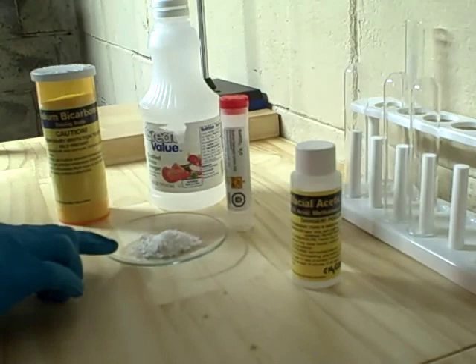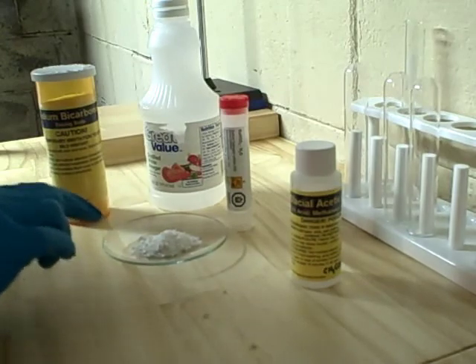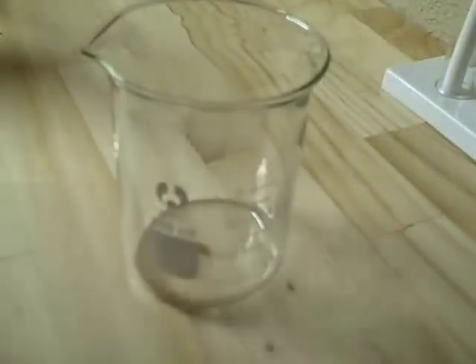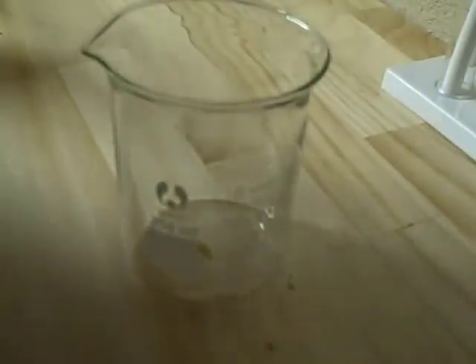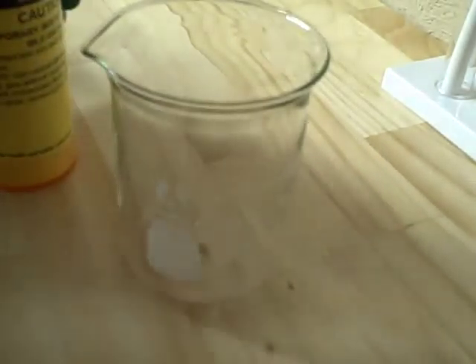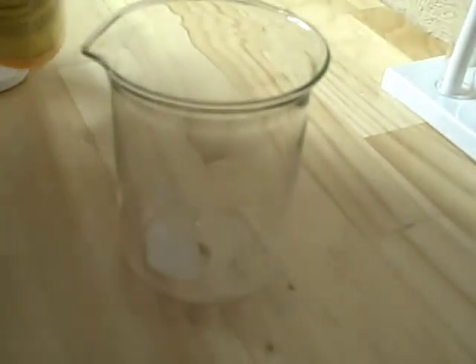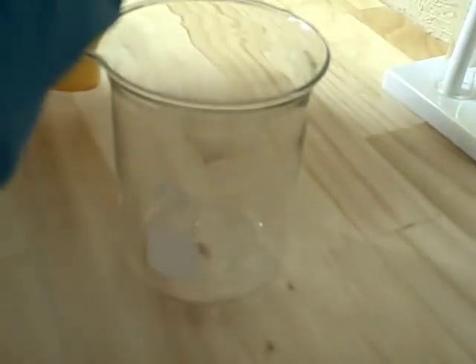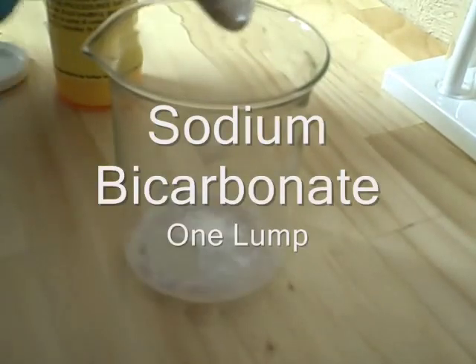The first thing that we'll need to do is make this sodium acetate. The first step is by taking a small lump of sodium bicarbonate and putting it in the beaker.